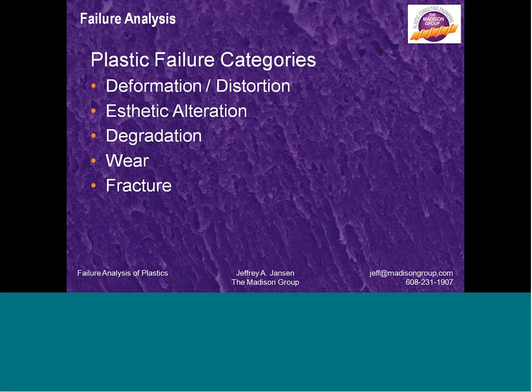We see degradation so that the part becomes inherently brittle. It doesn't have the integrity it once had. We see wear within a plastic component, and then we also see fracture. Now today we're going to talk principally about that last failure mode. We're going to talk about fracture when something actually cracks. That's going to be principally what we talk about.